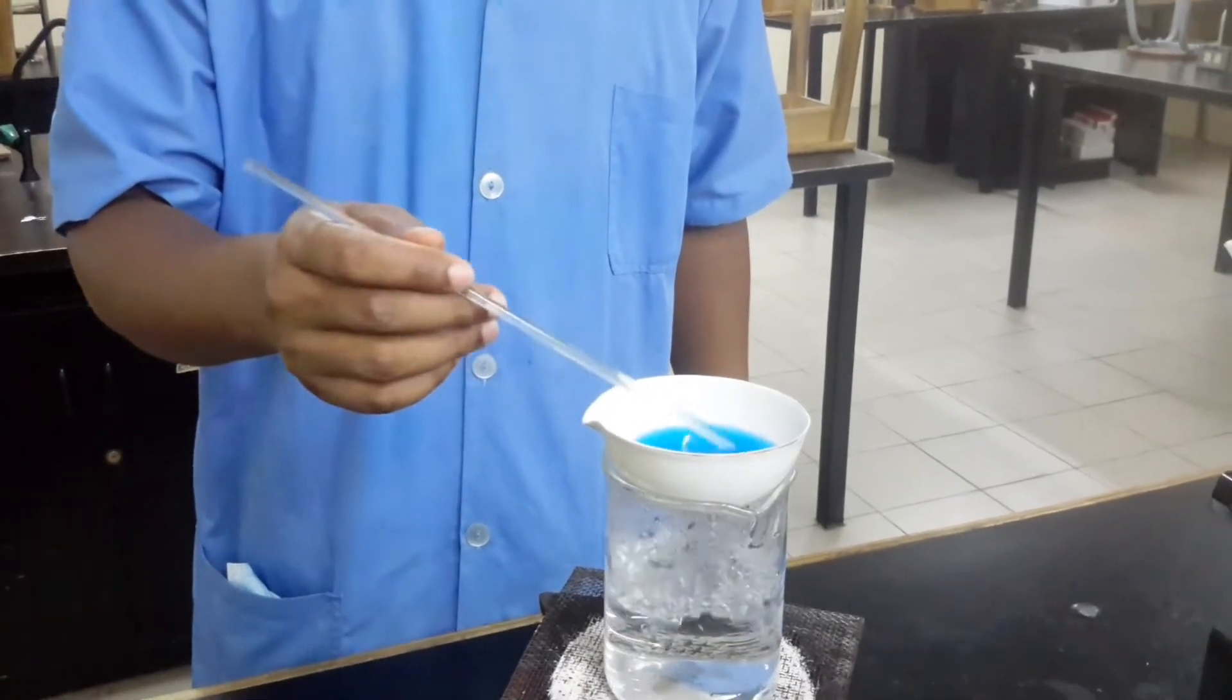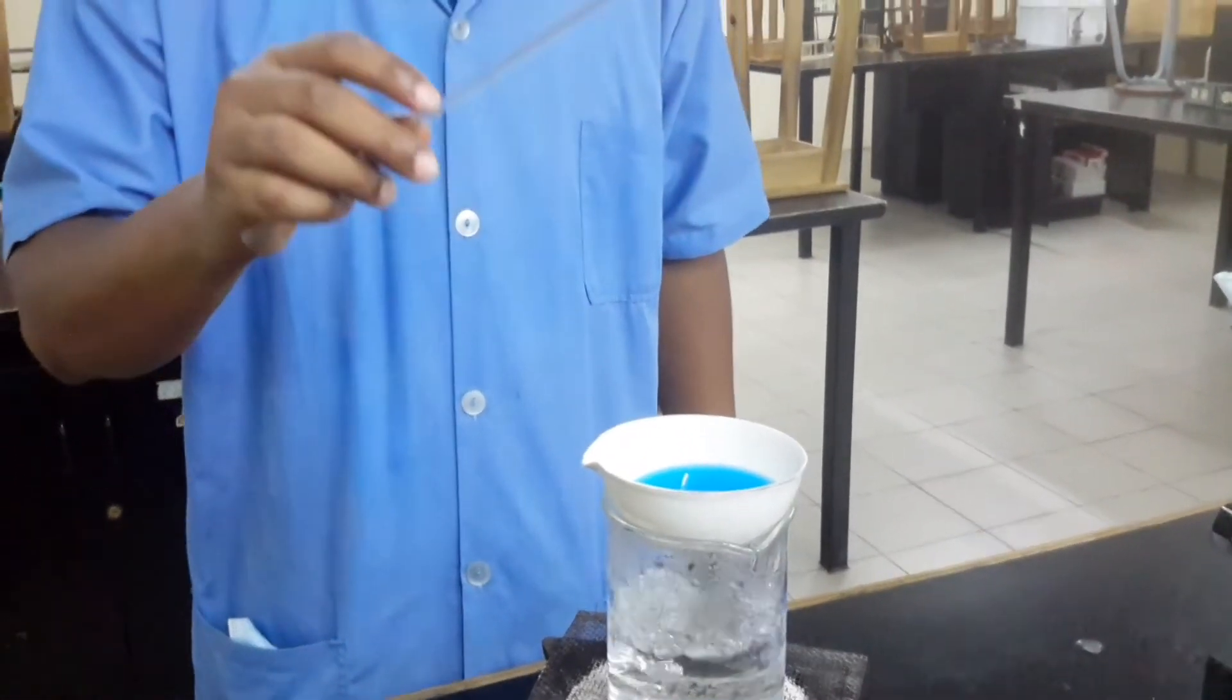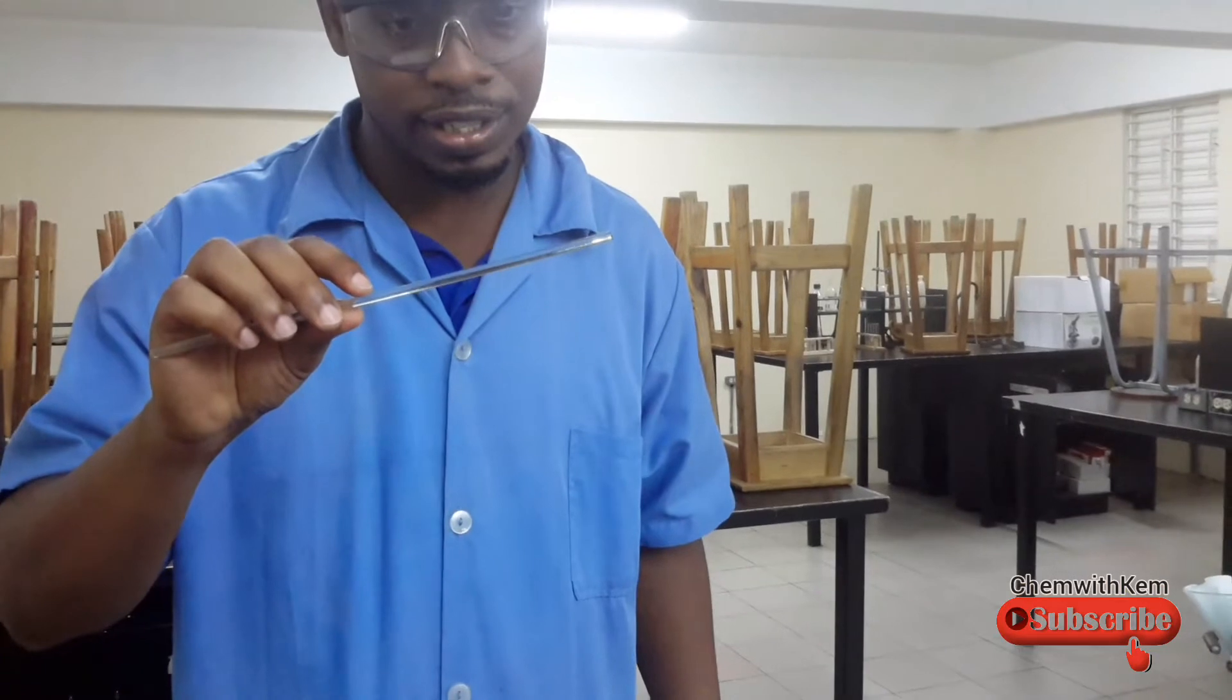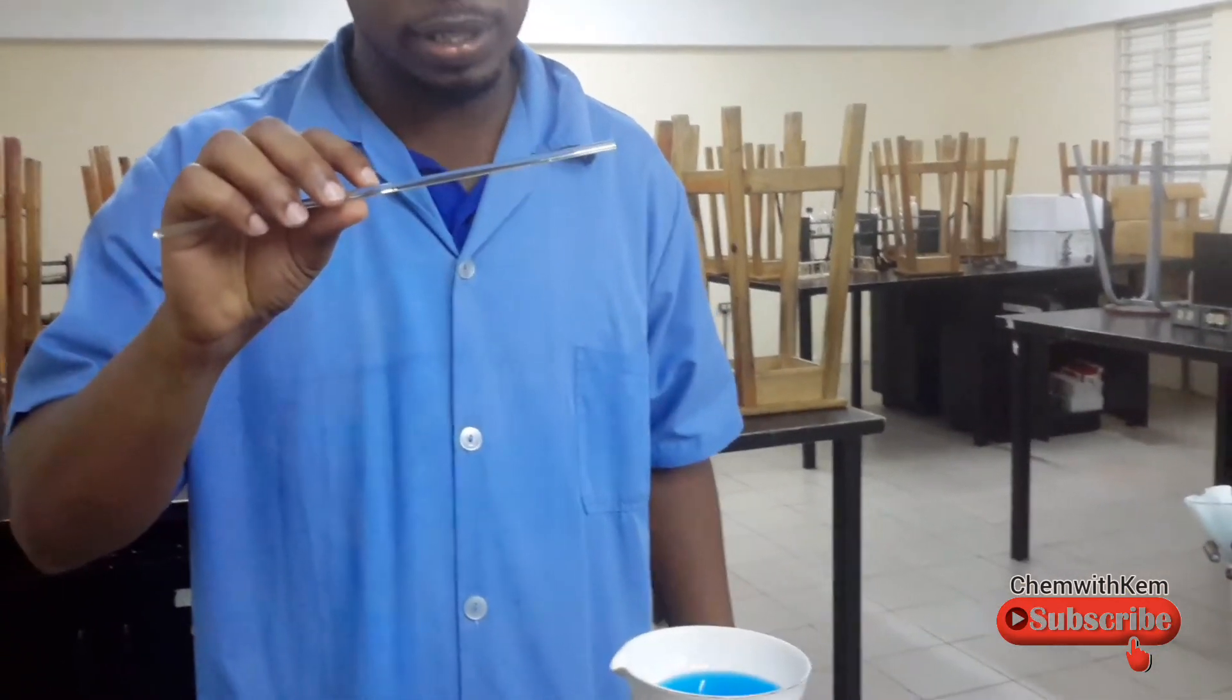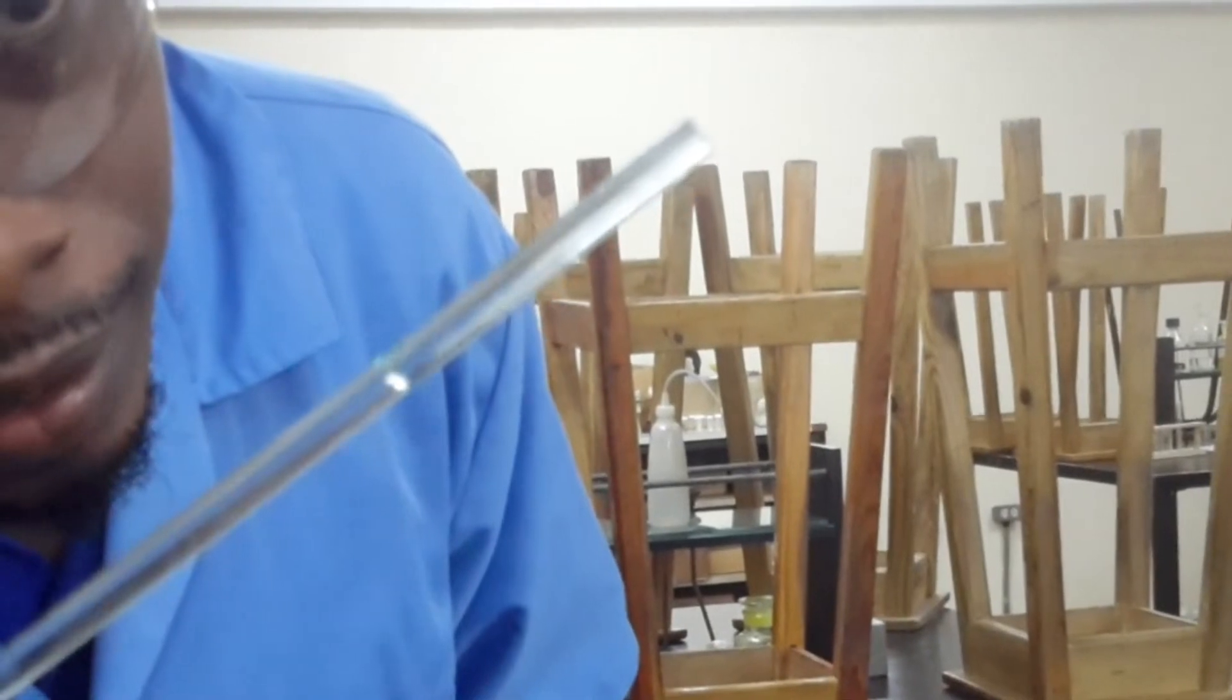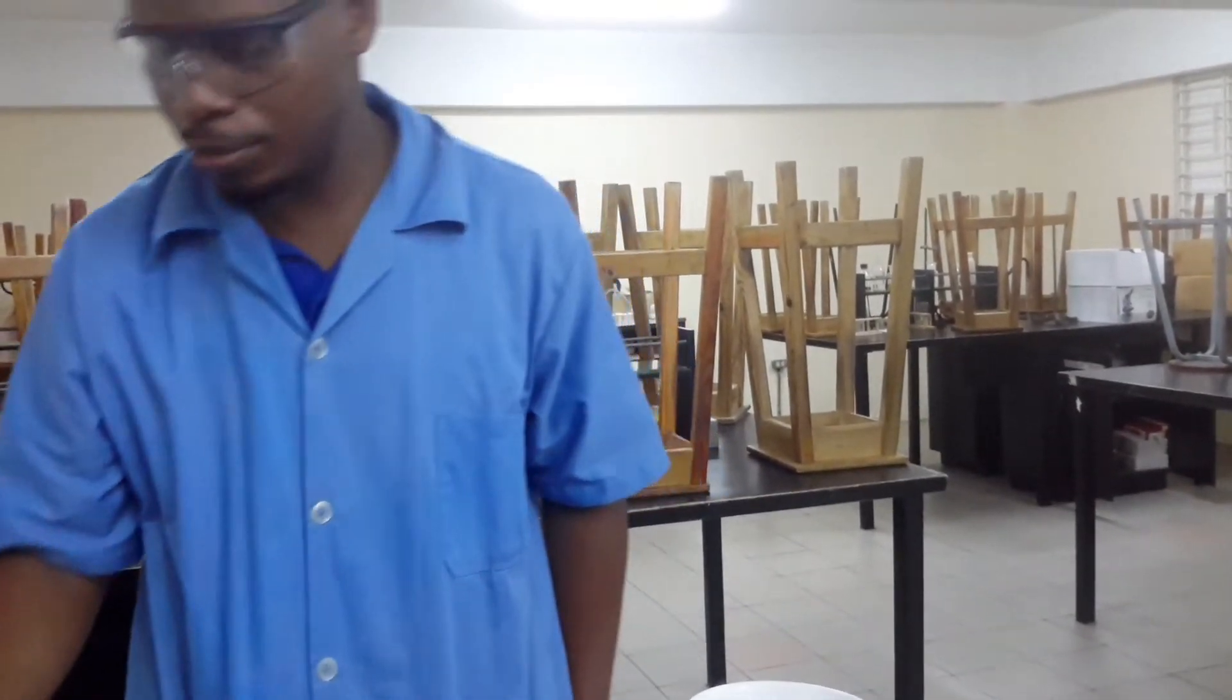We're just checking for crystallization. We'll just dip and then we'll just hold it up. Let it cool. And if when it cools we see crystals, then we can turn off the flame and just let the solution cool so the crystals can form. Not seeing, are we seeing any crystals there? We'll just let it sit for a while. Let me check it when it's fully cooled.